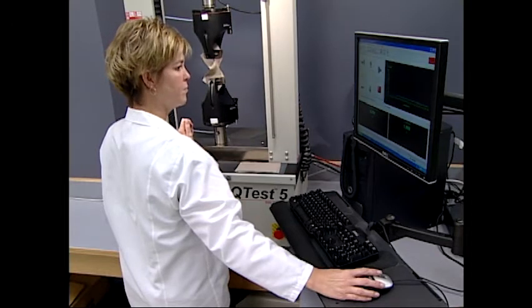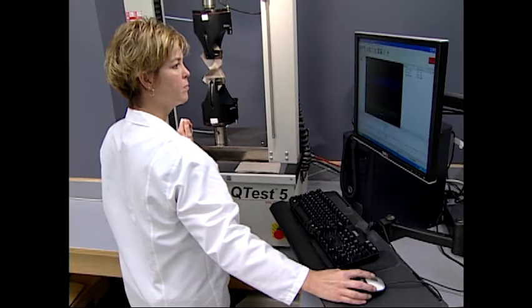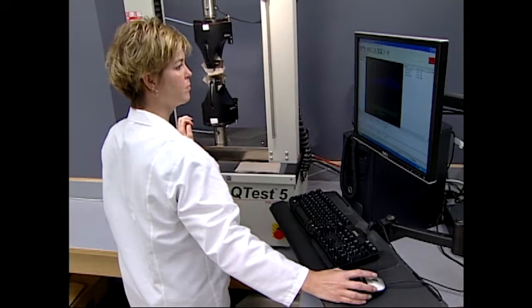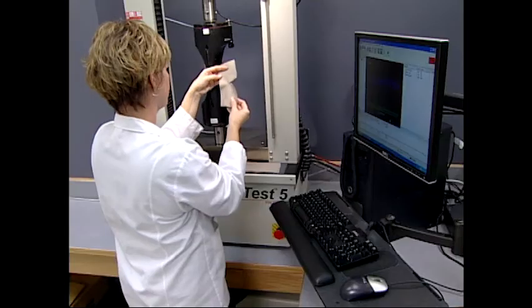Procedures used to measure tearing strength apply the force perpendicular to the yarns being tested so that tearing continues from an initial slit. The breaking force that is applied in tensile tests is applied parallel to the yarns that will be pulled apart. The tearing force cannot be compared to the tensile breaking force.